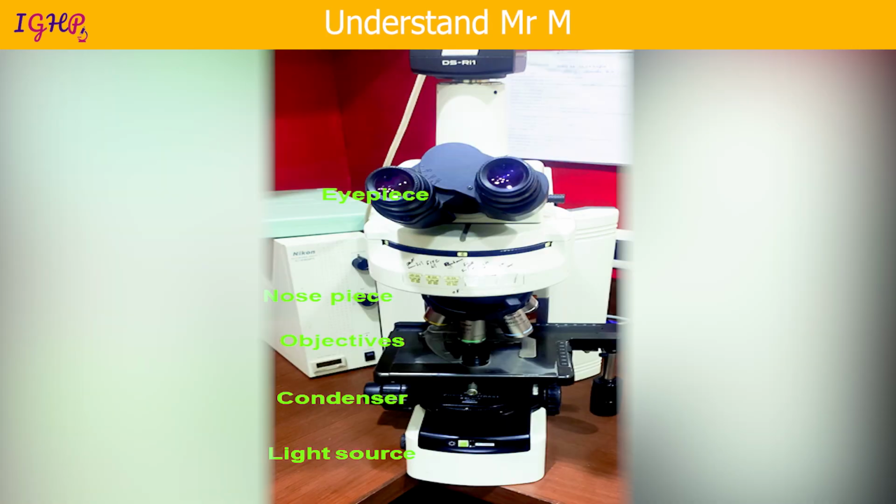So before we move further in this journey, let us understand Mr. M so that we can pursue this journey in a beautiful way. This is Mr. Microscope, and these are the different parts which we will be using as we focus the slides onto this microscope. As we are all aware from our basic MBBS teaching, the microscope comprises an eyepiece, and then a nose piece to which the objectives are attached. Then it has a condenser, and this is the stage, and below the stage there is a condenser, and at the base of the microscope there is a light source.